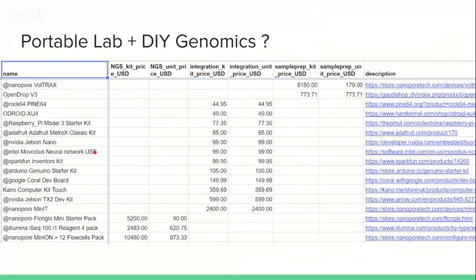They're not a computer. They're something that sits next to a computer, is connected to a computer. In this case, it could be a laptop, etc., and allows you to accelerate some of these computational aspects that can happen post-sequencing. And this doesn't need to be only base calling. It can be all sorts. It can be your machine learning for whatever you want to do, cluster it, etc.